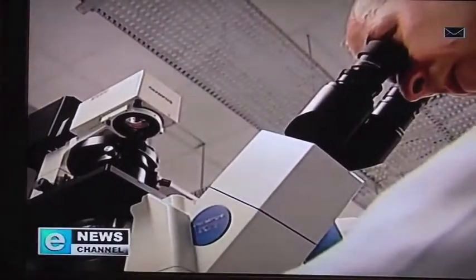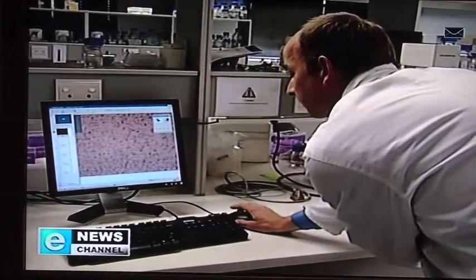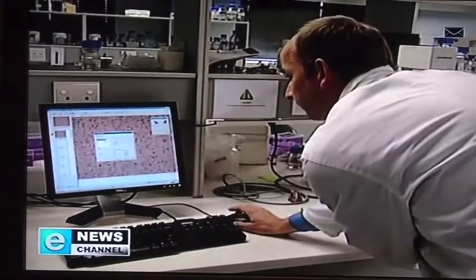When we create these very large, what we call libraries of gene variants, we trap them into microscopic droplets. So we combine oil and water and we create what we call an emulsion. And in each single droplet, there are billions of these in a single test tube, we're able to trap single genes that are coding for these individual enzyme variants.